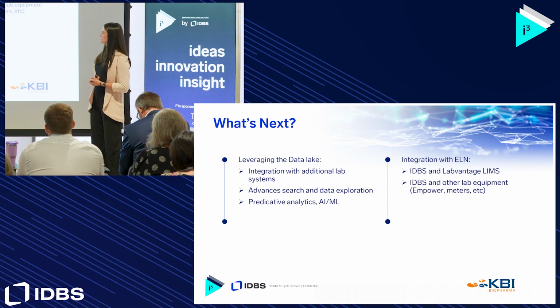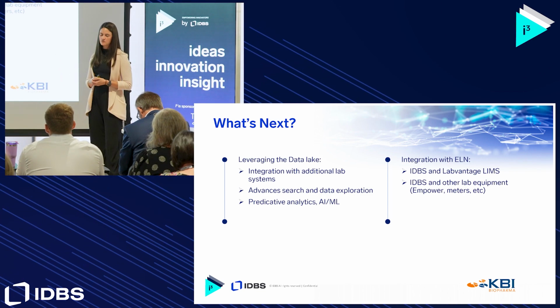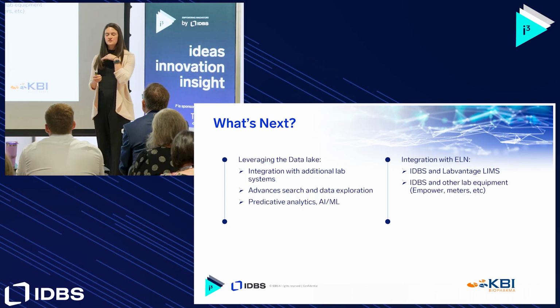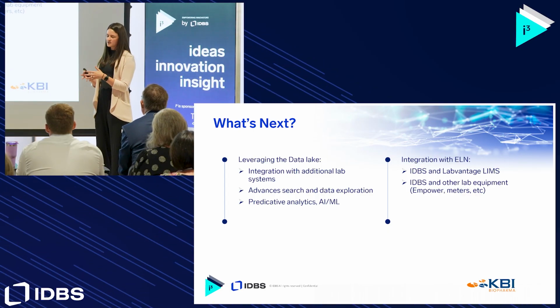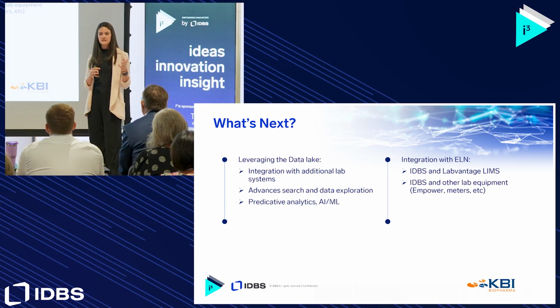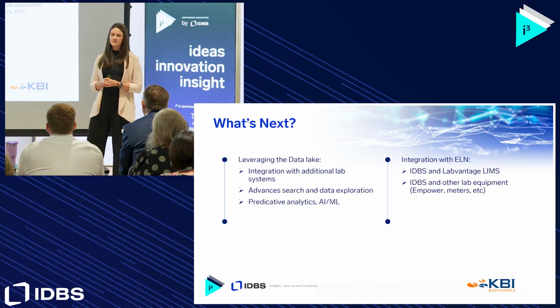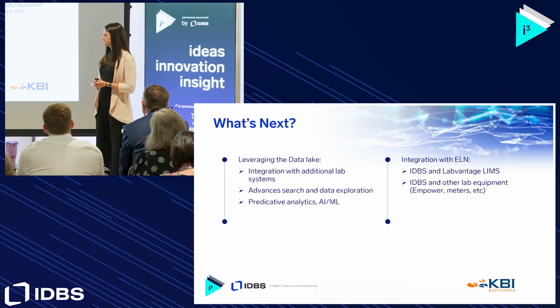And then as far as for ELN goes, we've focused most of our effort on data out, but now we really want to focus on data in. And so integrating those spreadsheets with other systems, connecting them to Empower, pH meters, all of those things to just continue improving and automating the scientist work.